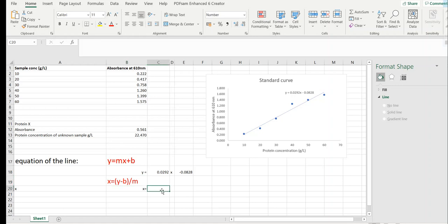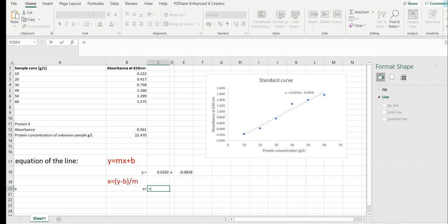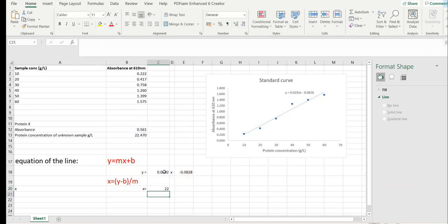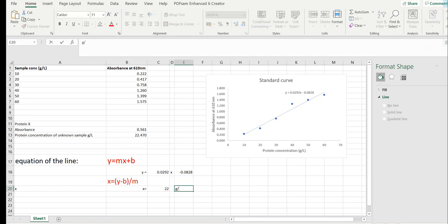In order to do that, you put an equal sign, open the bracket, you select the absorbance that we found, minus y-intercept, close the bracket, divide it by the slope and press enter. Again, this is the protein concentration of unknown sample in grams per liter.